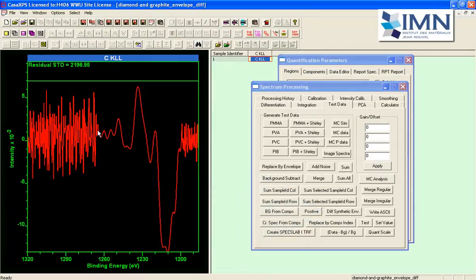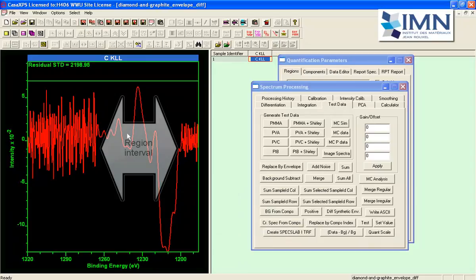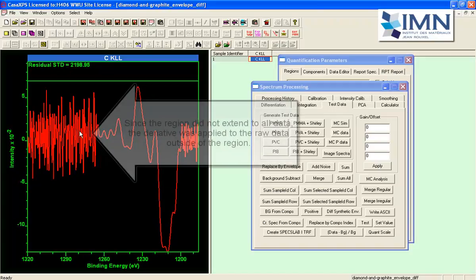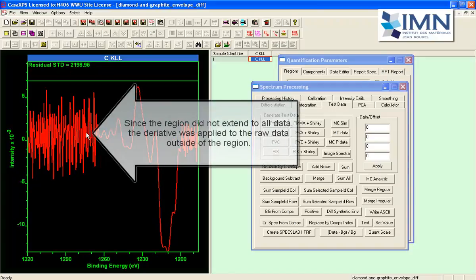And where the synthetic envelope has been defined we get a well formed derivative compared to what you are seeing here.